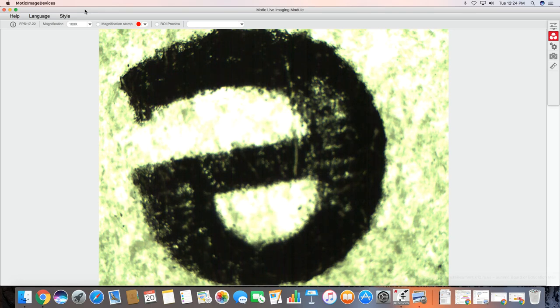Now if I want to get a closer view because I'm very interested in all of these little cracks in the ink I would switch to the yellow objective lens. Low power.